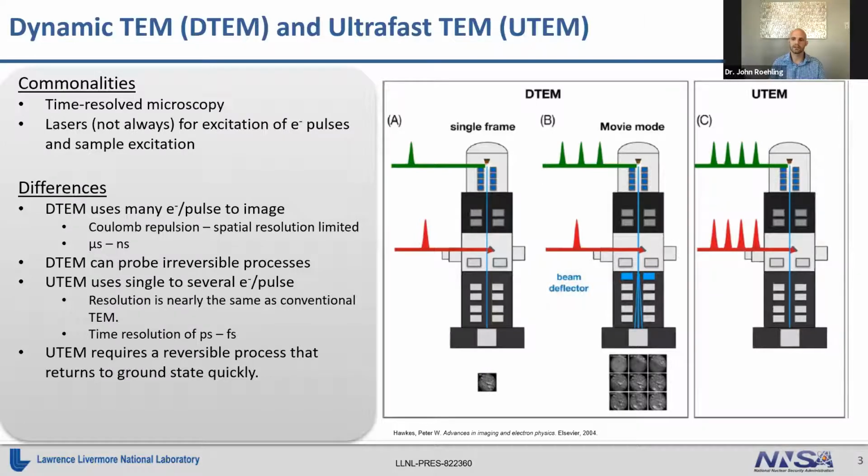And also because you don't require so many electrons all at once, you can use higher time resolution laser pulses. So the time resolution of a UTEM is greatly increased. It's on the order of picoseconds to femtoseconds, compared to DTEM, which is microseconds to nanoseconds.